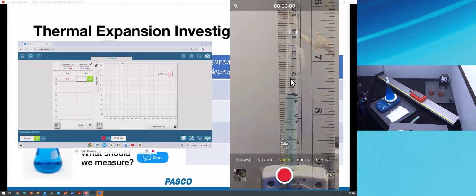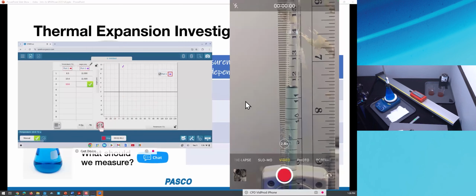You can see that the water level is rising slowly here. My experience is with the hot plate on high, it's going to go quite rapidly. All right, so it's approaching 11.5. Sometimes it goes so rapidly, it's a bit tough to get. So I'm going to wait until it's at 11.5 right now and press keep. And now we have our 2 data points. Perfect linear relationship.